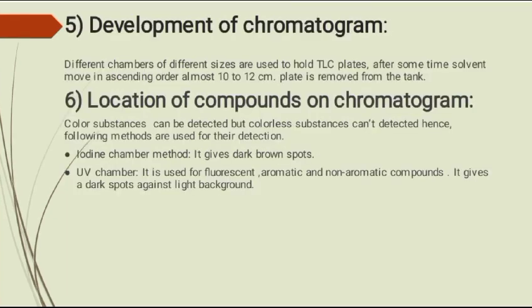Fifth step is development of the chromatogram. Different chambers of different sizes are used to hold TLC plates. After some time, the solvent moves in ascending order almost 10 to 12 cm. After this, the plate is removed from the tank.